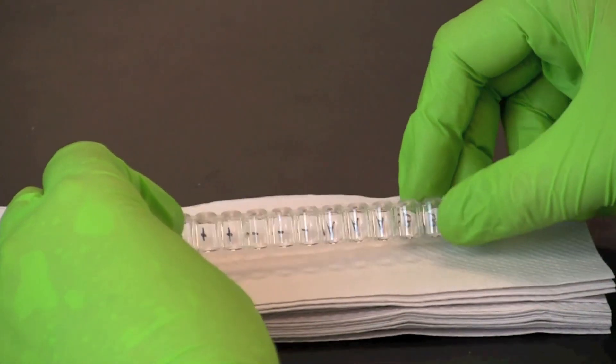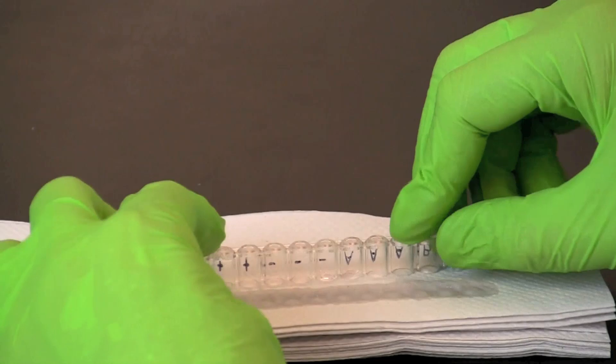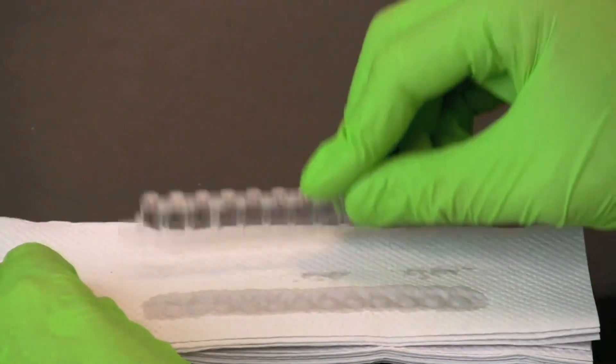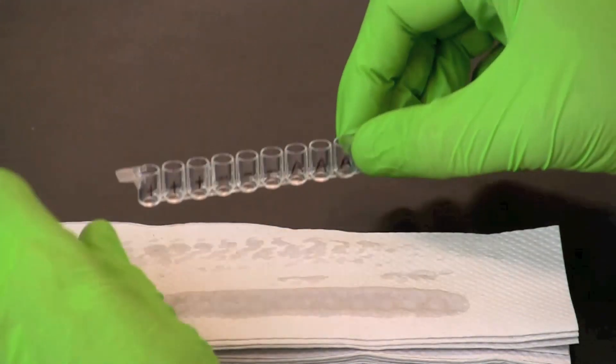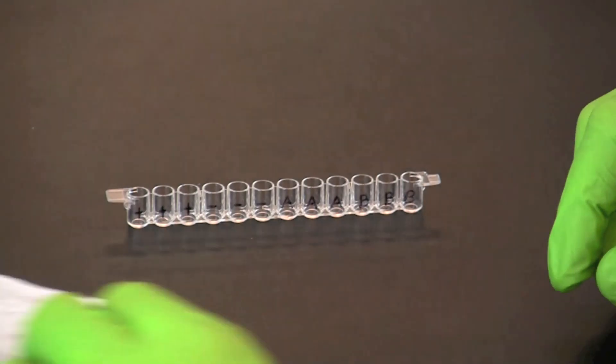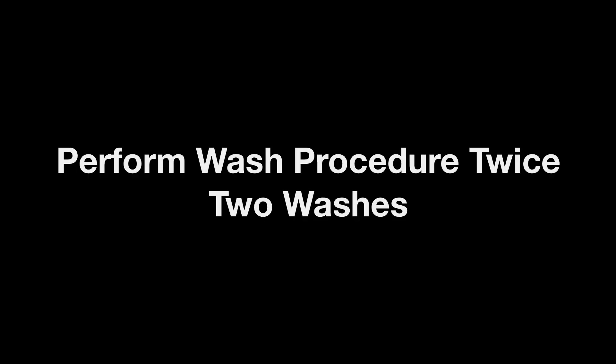Tip the microplate strip upside down onto a short stack of paper towels and gently tap the strip a few times to empty the wells of serum sample. At this point, repeat the wash procedure using wash buffer twice.